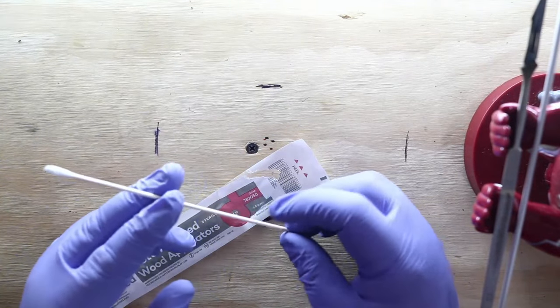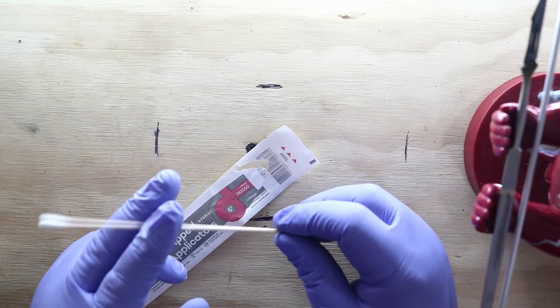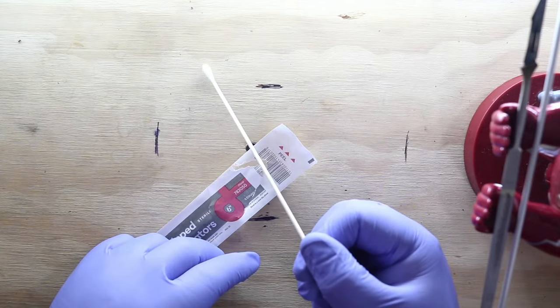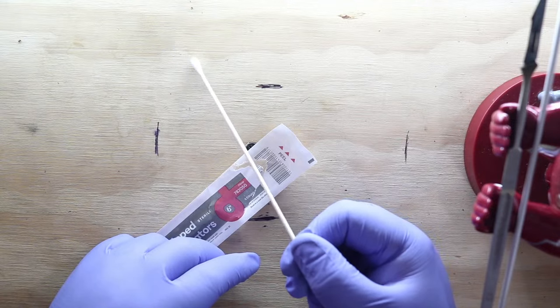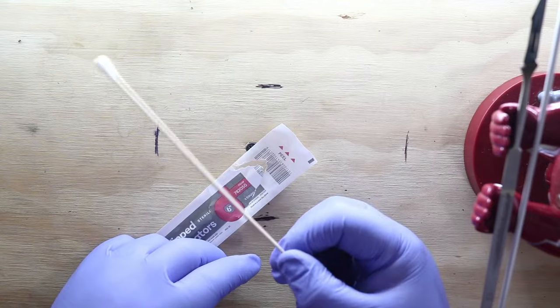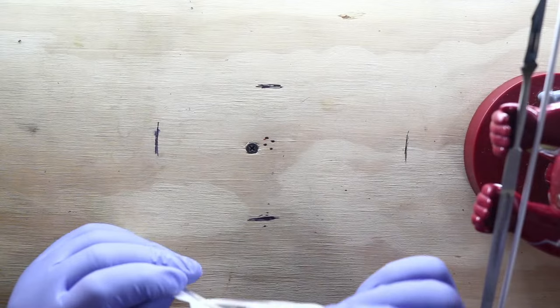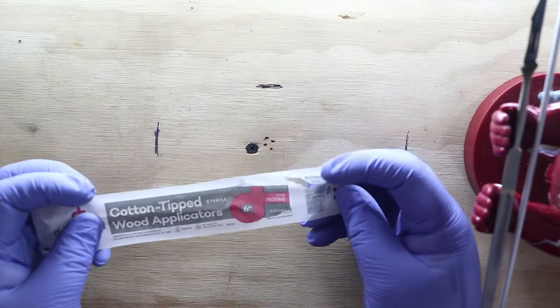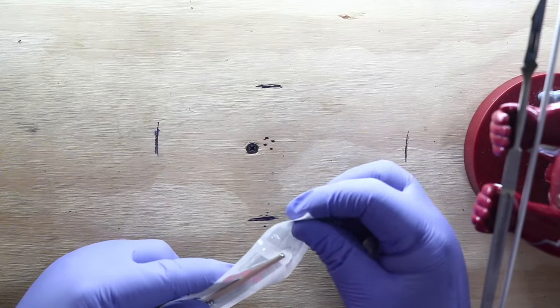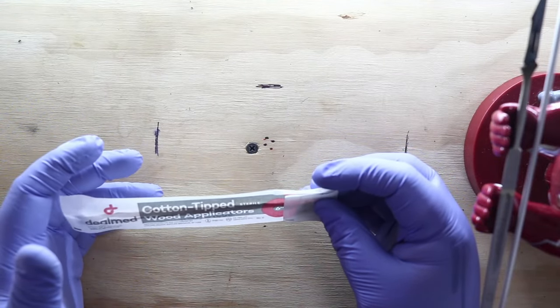You can grow it out yourself. You can take it and rub the spores on a slide and check it on a microscope, for those of you that like to do your own contamination identification. These things are super handy to have on hand. I throw a pack of 200 in my truck, a pack of 200 in my bike, a pack of 200 in the lab. I have these things everywhere because they're super cheap and super useful. If you're ever in the field, you can just take the swabs, close these back up, and do whatever you need to with them in the lab.